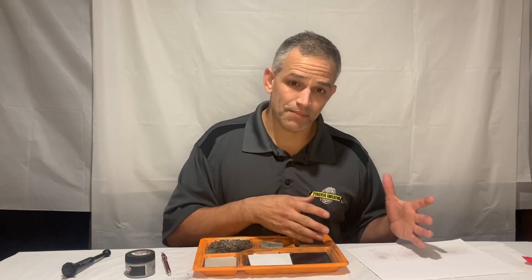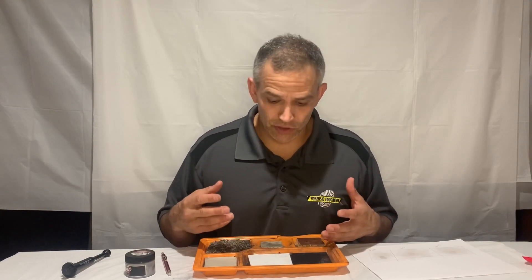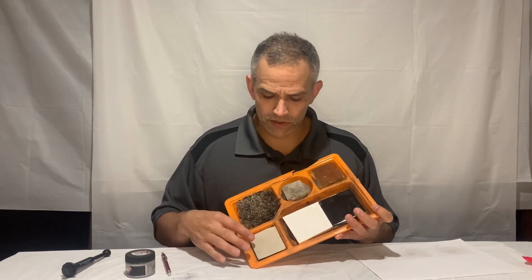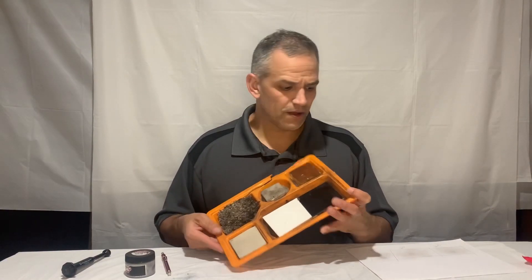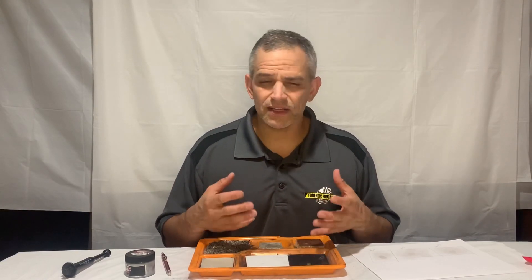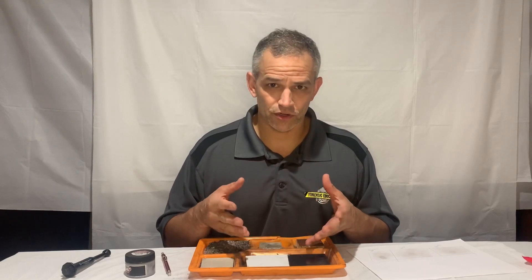Now when I say paper, we're using that as all porous surfaces. Tile and things like that are non-porous. So we're talking about porous surfaces — paper, cardboard, unfinished wood, things like that. Those would be porous surfaces.